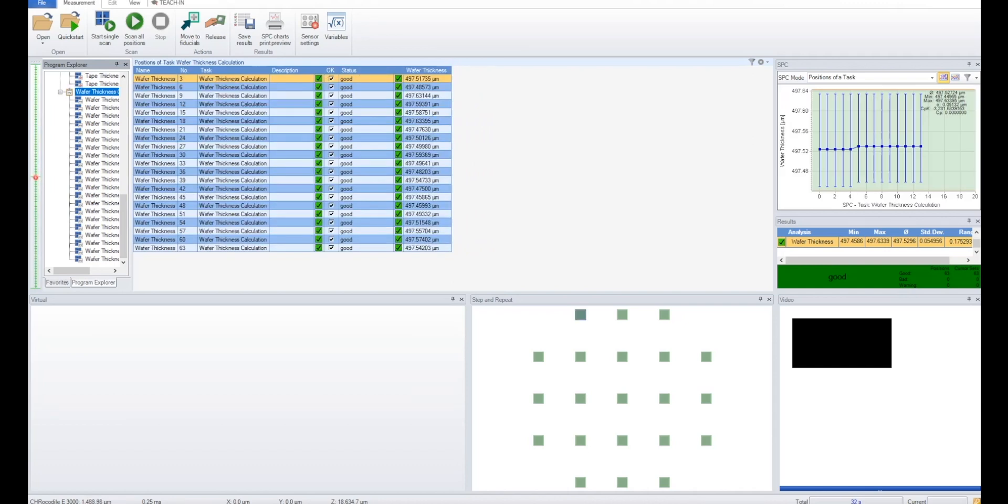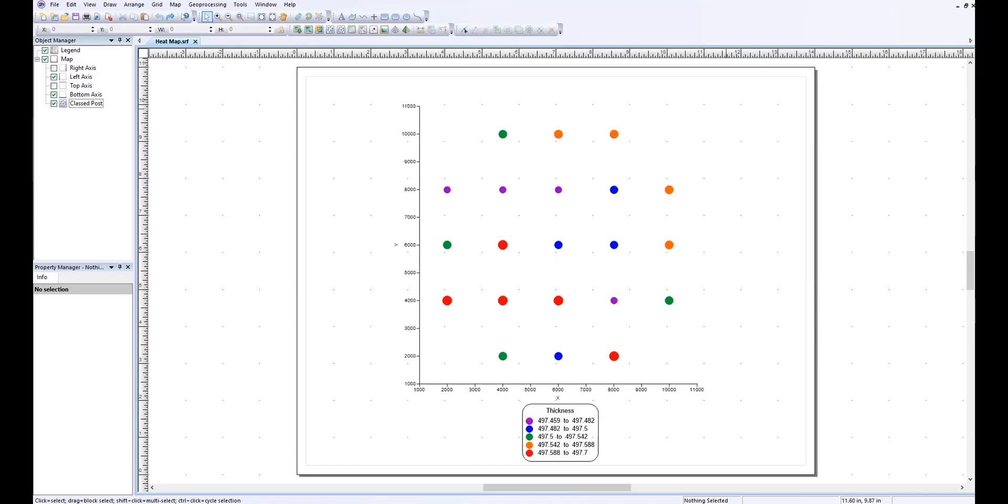The software comes with built-in SPC charts where you can set different control limits in order to quickly identify any measurements that are bad or out of spec. The results can easily be exported as a heat map showing a quick visual representation of the thickness distribution across the wafer. This can be very useful for putting together reports or presentations.